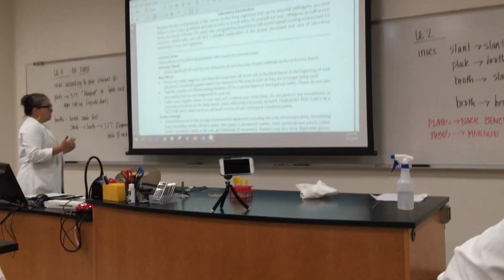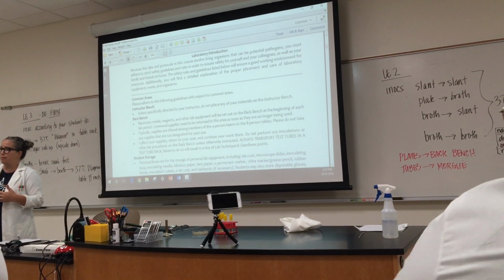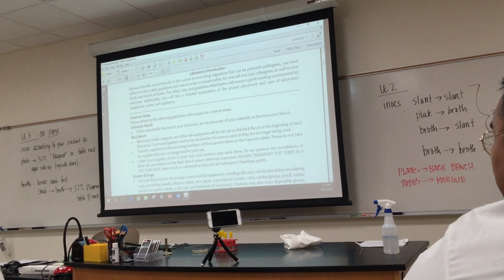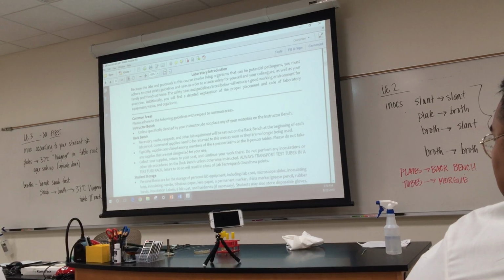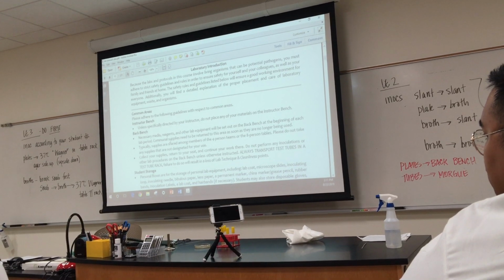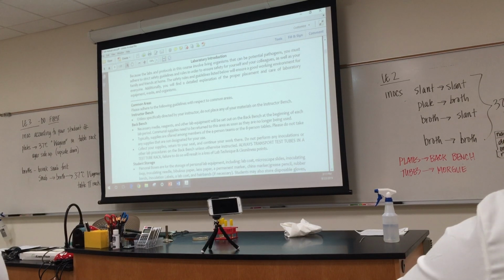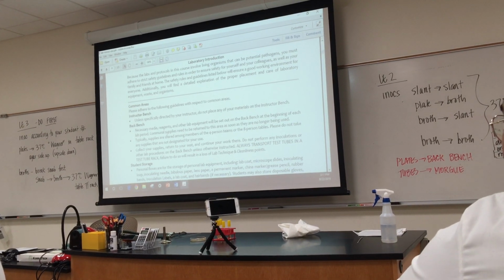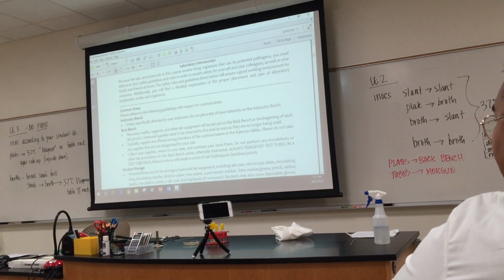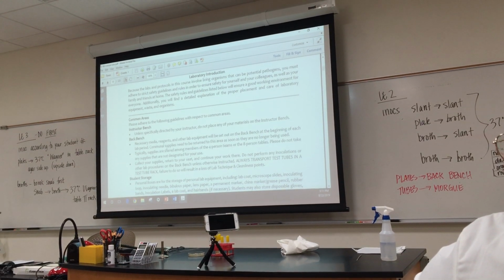So typically those supplies will be shared either among your whole table or among your team of 4. So for instance today, each team of 4 will get a plate with E. coli, a broth with E. coli, and a slant with E. coli. So designate one person from your team of 4 to go back and get those supplies and bring them back. You will each go back and get all of the other things that you need individually, right? But the organisms are shared.